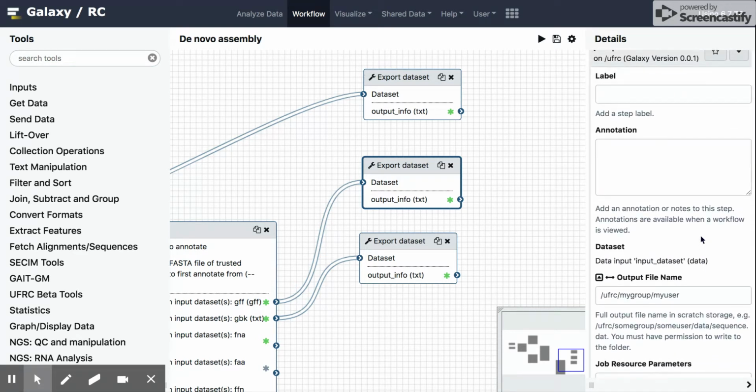So just as an example, and I mentioned this, there's three exports here: the assembly FASTA file, the GFF file, and the GBK file. If I was working on this, and again, using the Klebsiella pneumoniae example, I would have a folder called KPC or Klebsiella pneumoniae. And underneath that, I would have assemblies and annotations. In the assemblies, I'd put all these FASTA files exported from the workflows, and under annotations would be either all my GFF or GBK files that would dump into there.